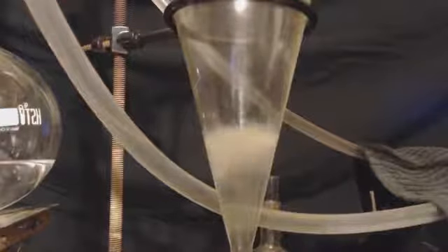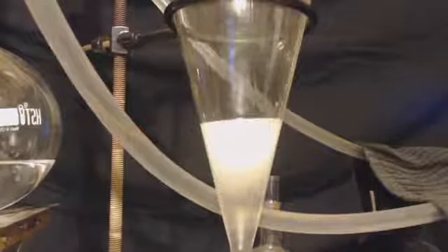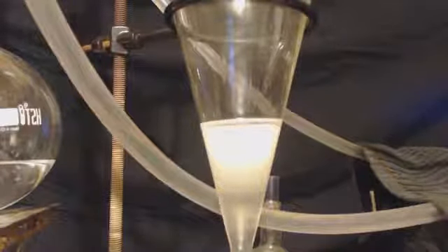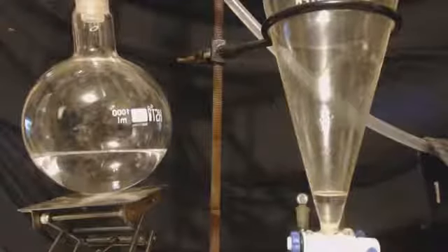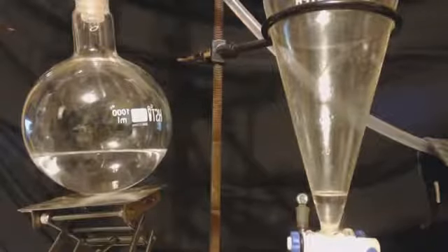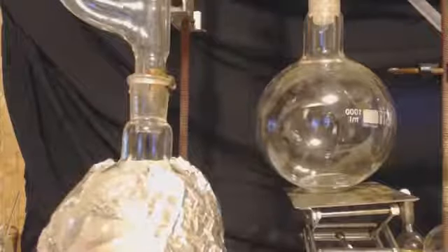I'm going to dump a little bit of methanol in there. Okay, you can already see how it took that soapy stuff out of the top layer. Now it's all crystal clear like. And there's that little bit. See, I left a little bit at the bottom there, but you can tell all that clear part is stuff that I can also use. You know what I mean? 10-20% of that is toluene.